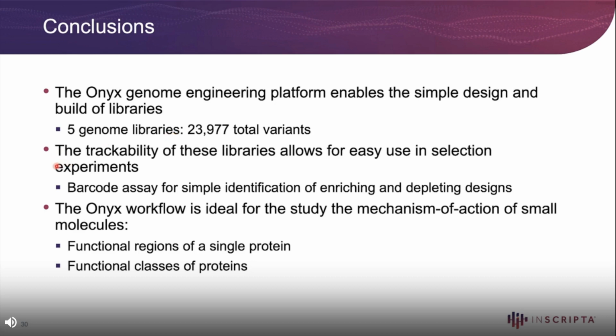The trackability of the designs in all of these libraries allowed us to have such a high throughput selection experiment. Using the barcode diversity assay, we were able to look at the enriching and depleting designs in the population and analyze the distribution of these designs.